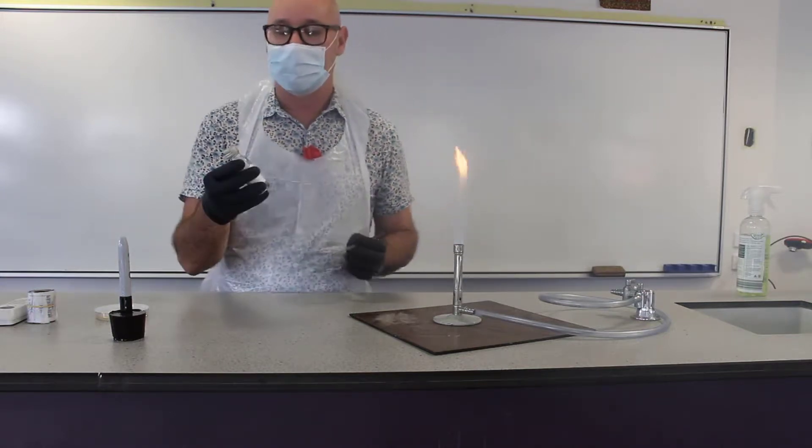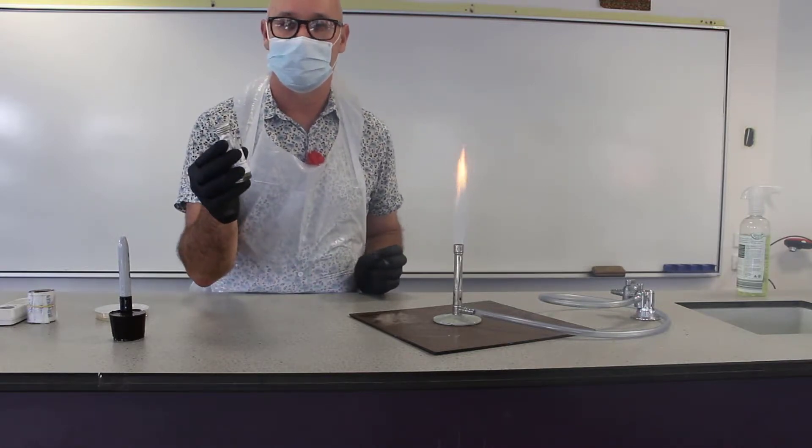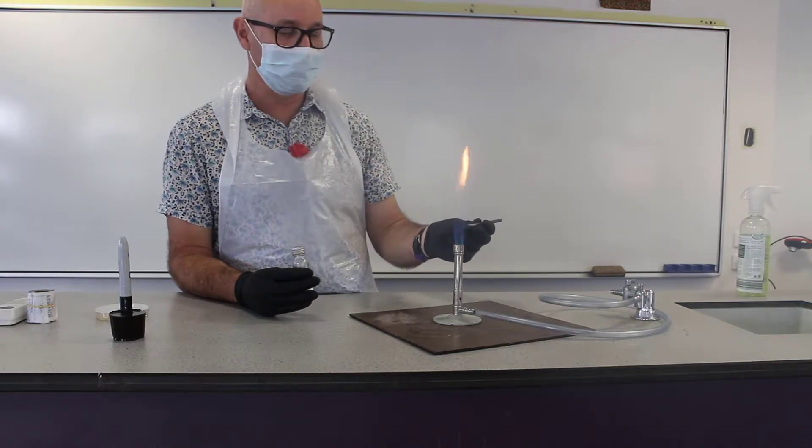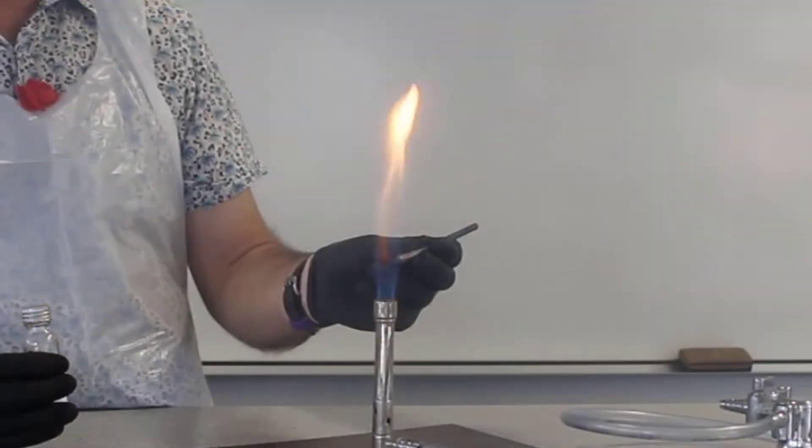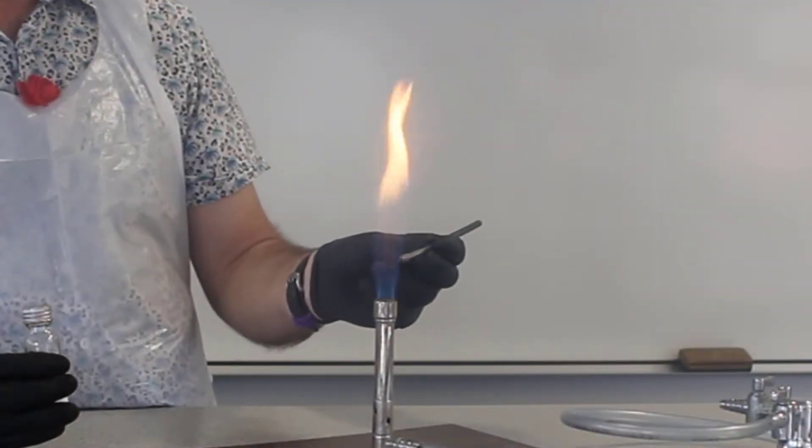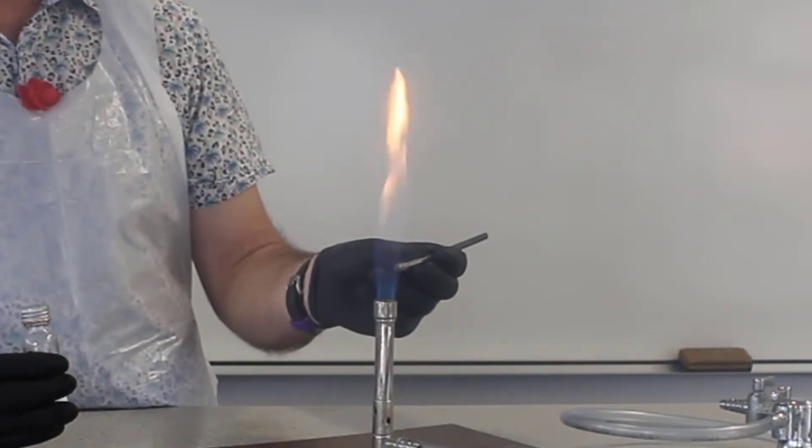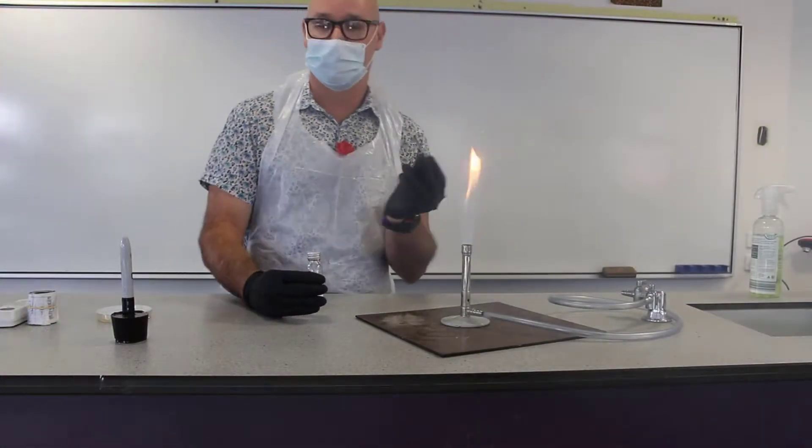We've also got our bacteria in the broth, in a glass jar. Alright, so the first thing we need to do is flame our loop. We're going to make the loop red hot, so it's actually going to glow red hot all the way to the end of the loop and back. Then we're going to allow that to cool down.